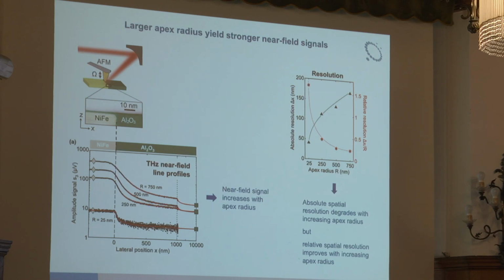And the reason for that is that we use the same tapping amplitude. That means we have an extremely small tapping amplitude, and that was mentioned by some speaker, I think Lars, that if you change the tapping amplitude, then the effect is similar to keeping the tapping amplitude constant and increasing the harmonic. So you get a huge contrast enhancement and also resolution enhancement. That's another topic that one could bring up. Adrian was asking me to talk about it, but I think time is not enough. The higher the harmonic, the better the spatial resolution. This is this virtual tip sharpening.